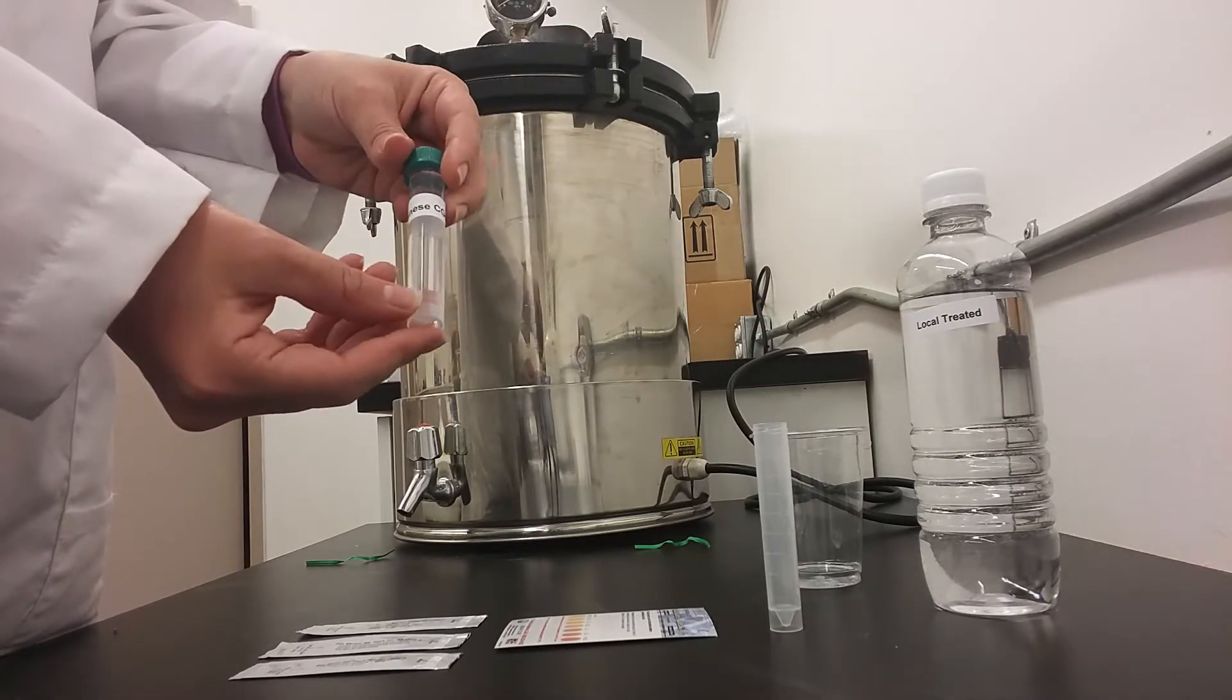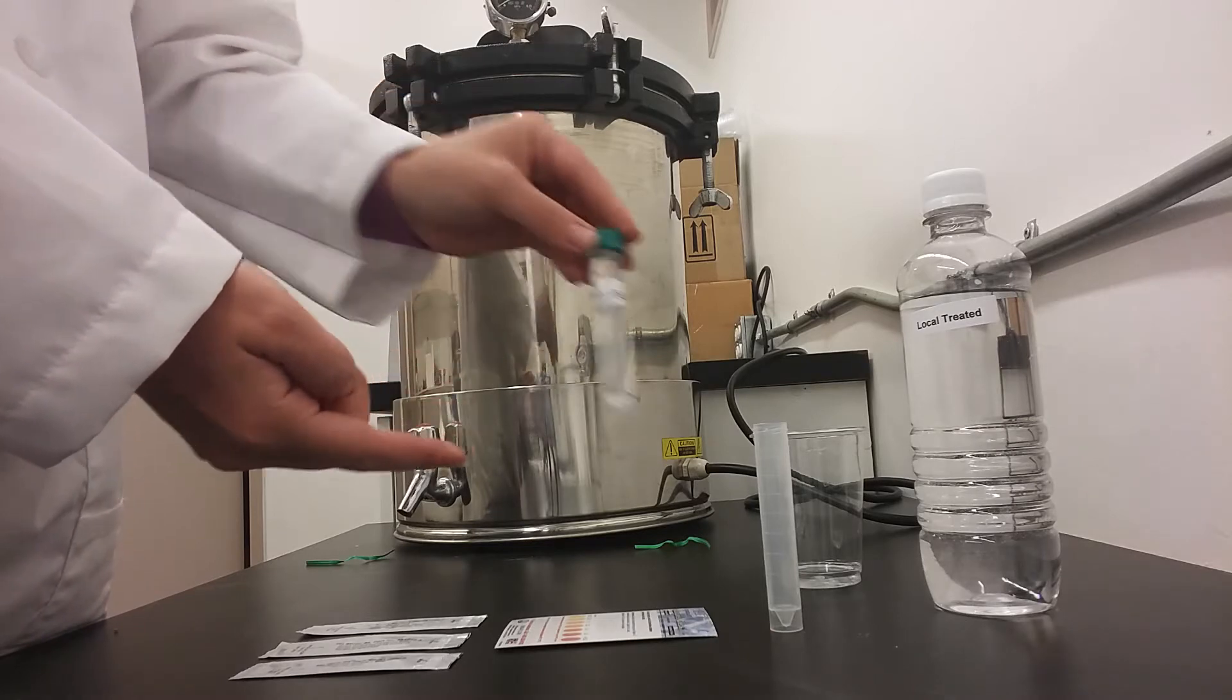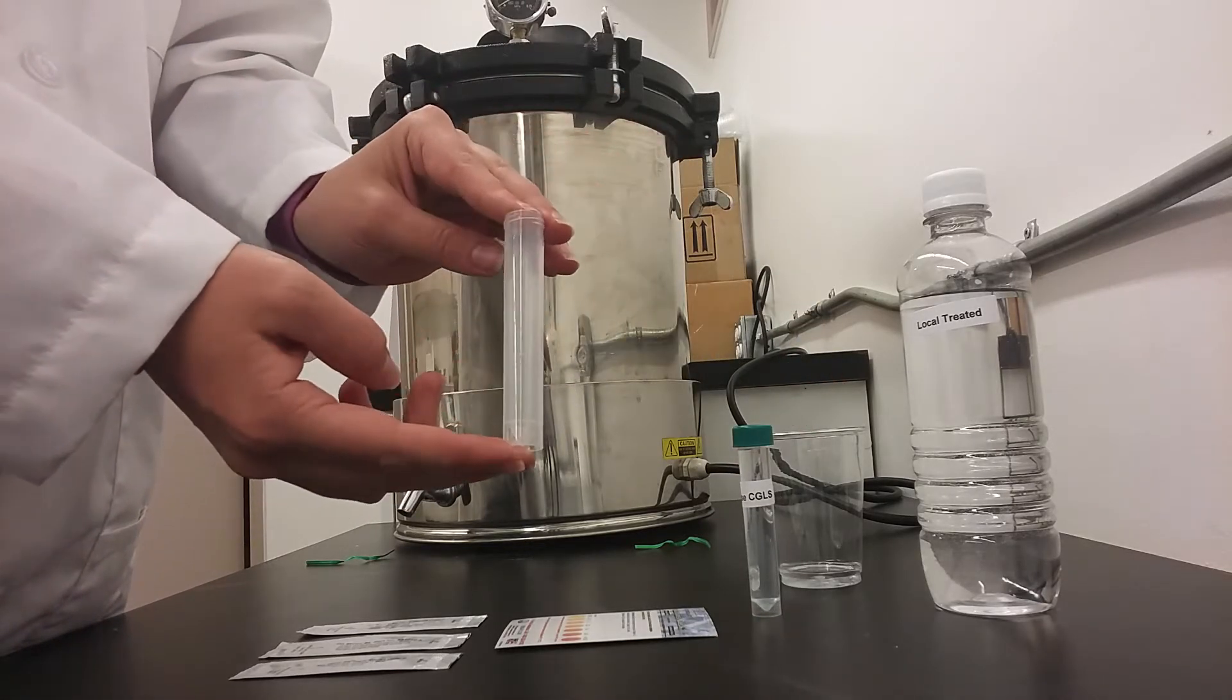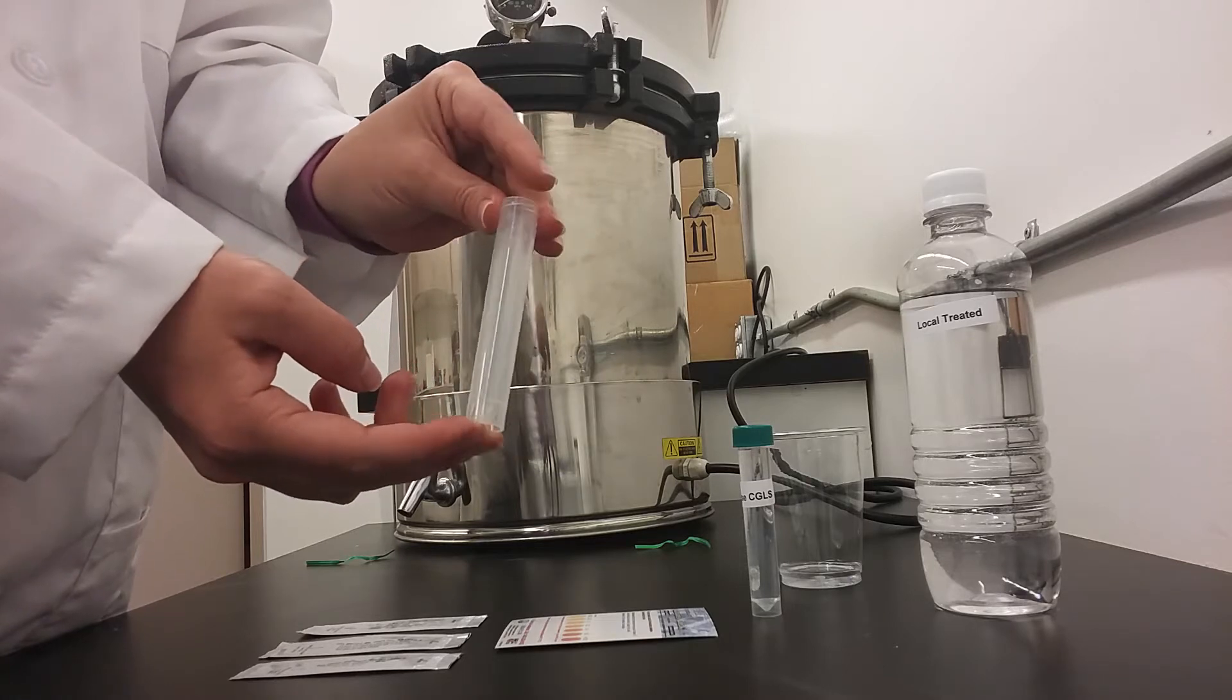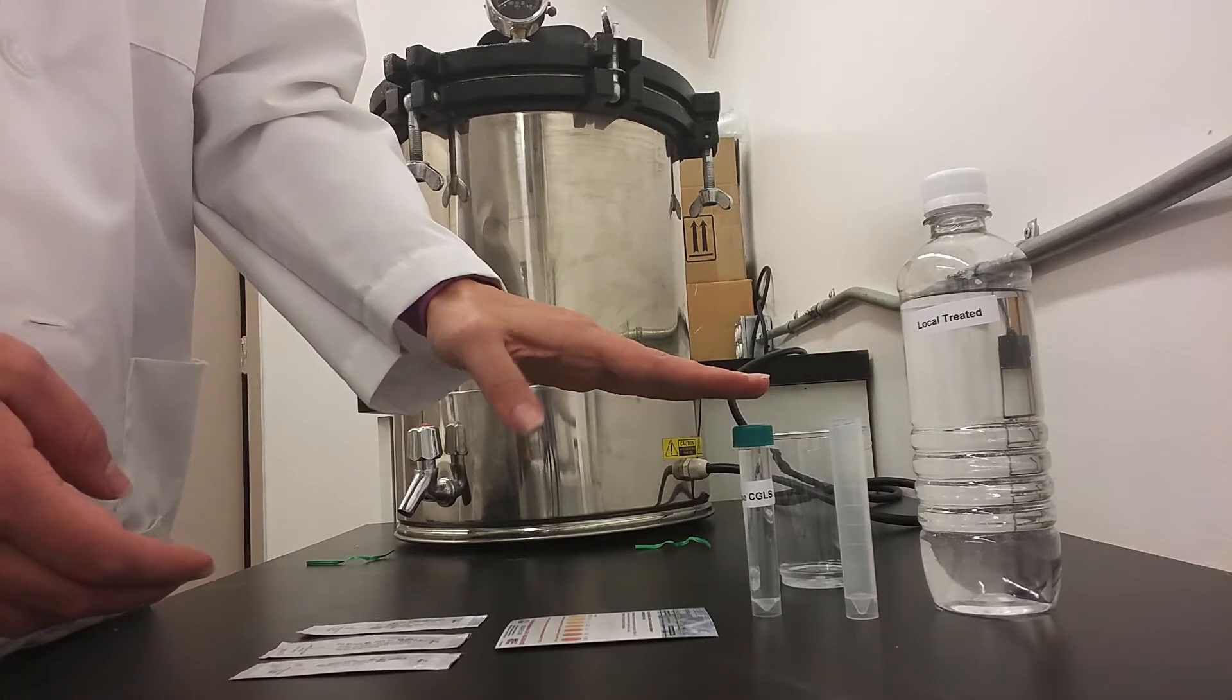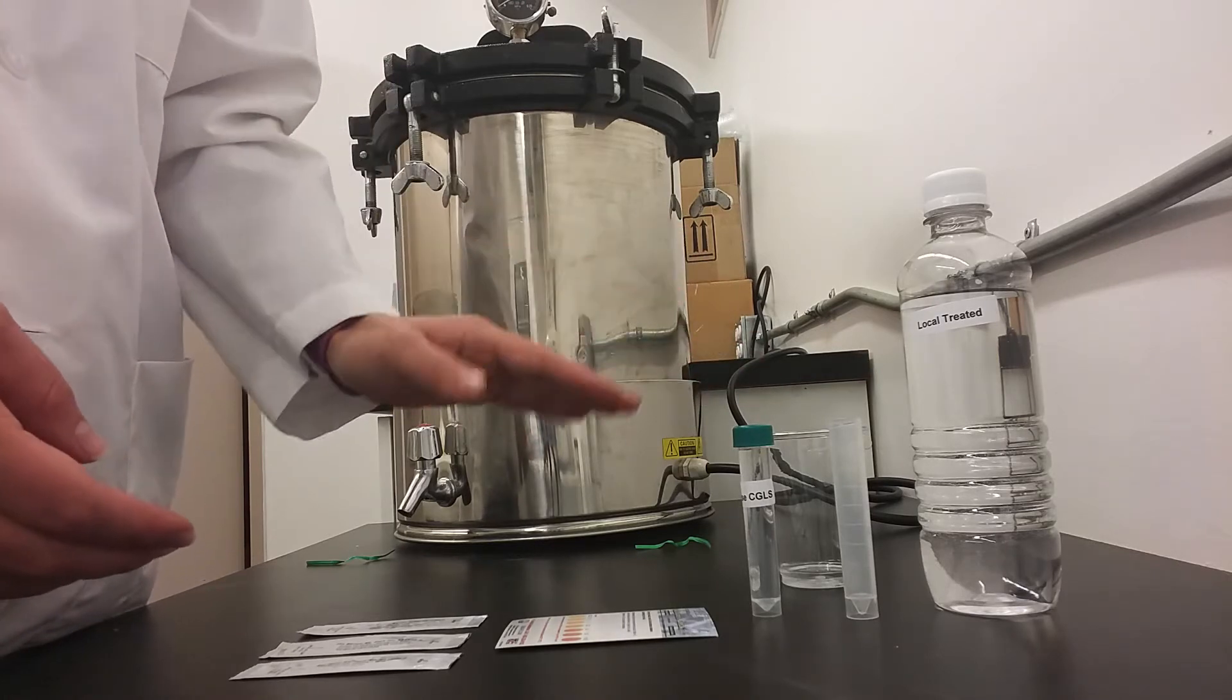For this one we will be using the manganese sample that comes with your test kit. The test kit also includes empty vials for testing different sources of water that you choose to test, but for this demonstration we'll be only using the manganese sample that came with the kit.